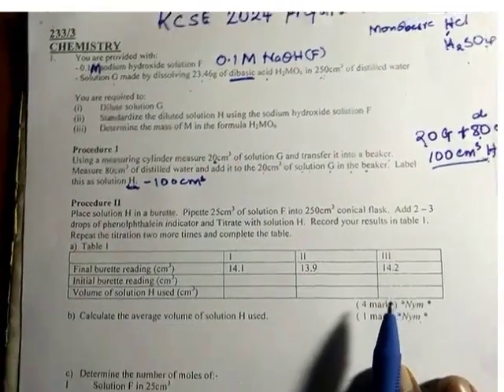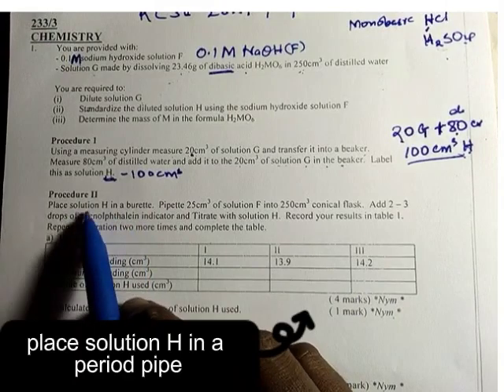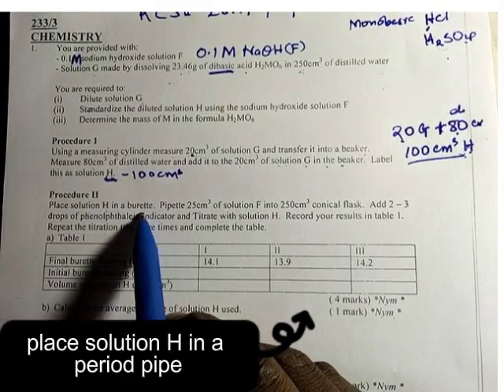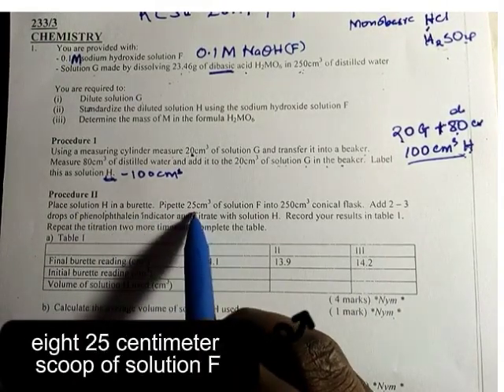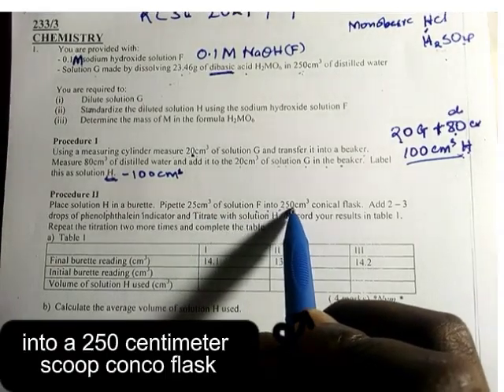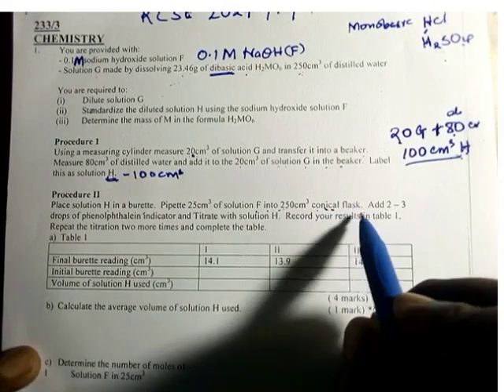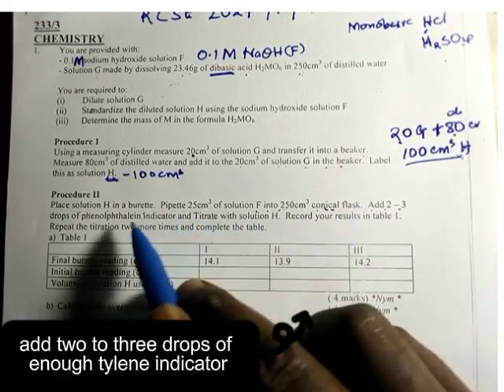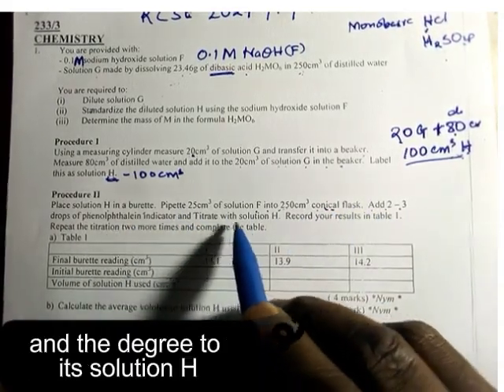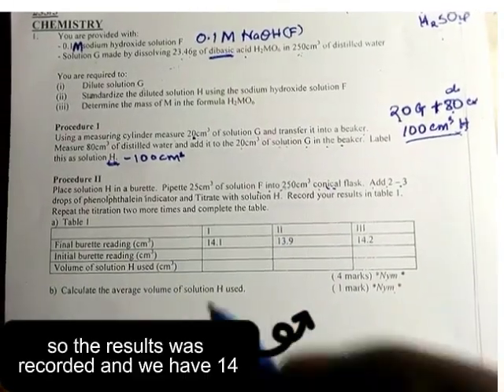Procedure 2. Place solution H in a burette. Pipette 25 centimeters cube of solution F into a 250 centimeters cube conical flask. Add 2 to 3 drops of phenolphthalein indicator and titrate with solution H. Record the results. So the results were recorded.